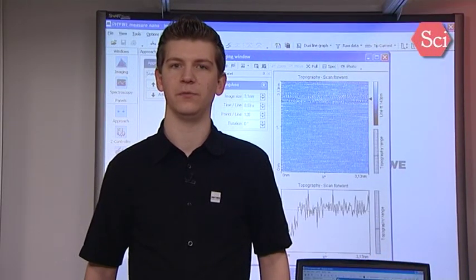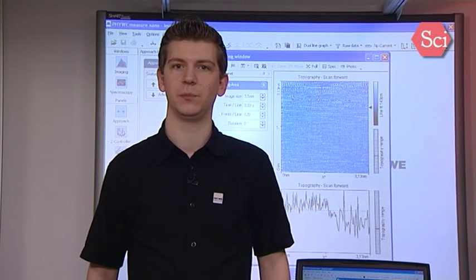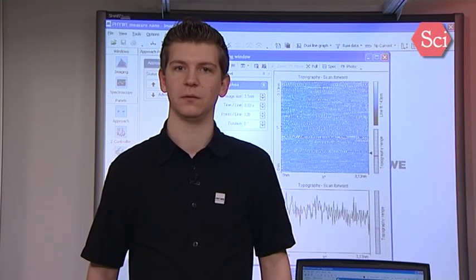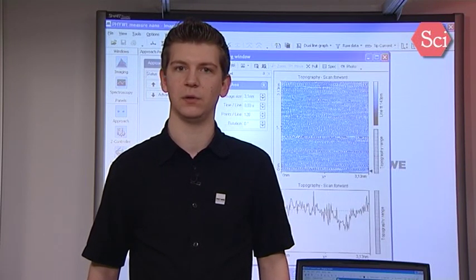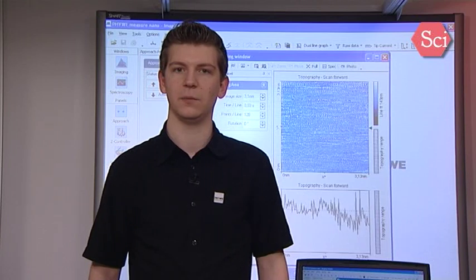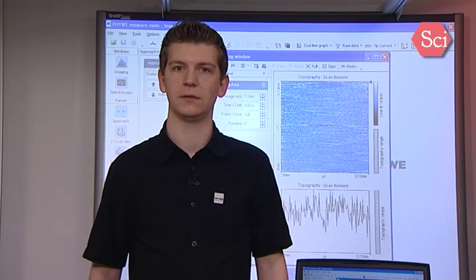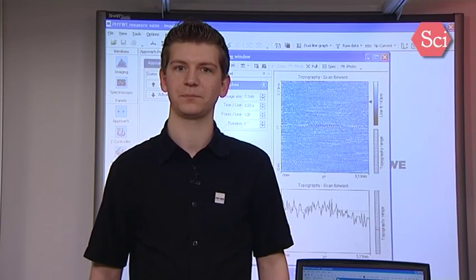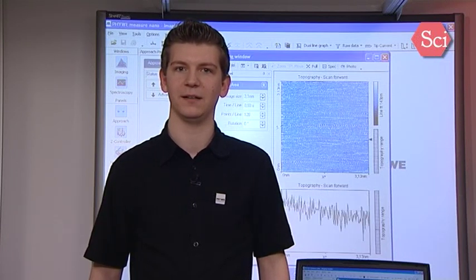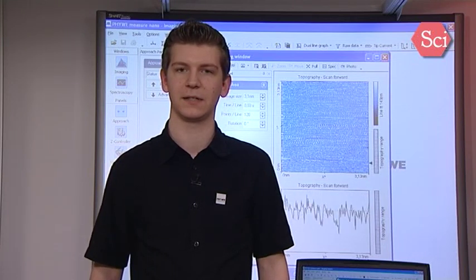We have now finished our first measurement. In addition to the normal imaging mode, we also can do spectroscopy measurements in the nanometer range. If you have your own samples, you can put them on the spare sample supports supplied in the package. In general, make sure the setup of the microscope is on a very stable and steady table — this will reduce noise due to building vibrations. Now have fun with this exciting experiment. Gerd Binnig and Heinrich Rohrer earned the Nobel Prize in Physics in 1986 for this scanning tunneling microscope.